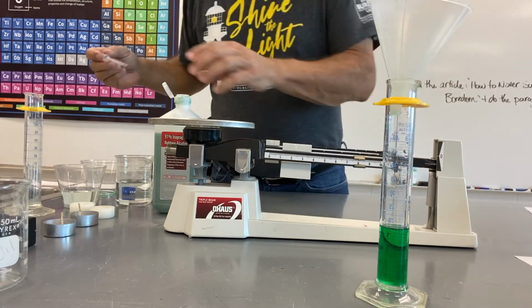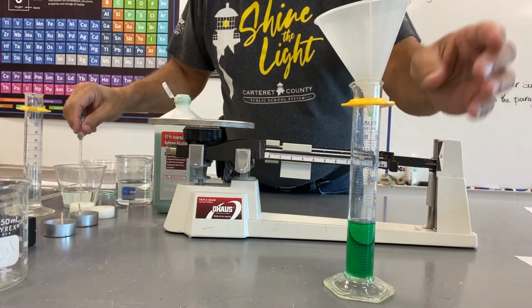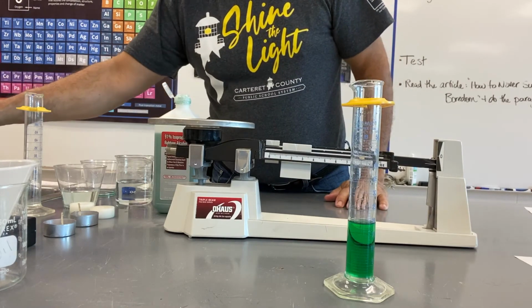Okay, there we are with 20 milliliters of alcohol. Take the funnel off, that would be cheating. Add that weight in there.